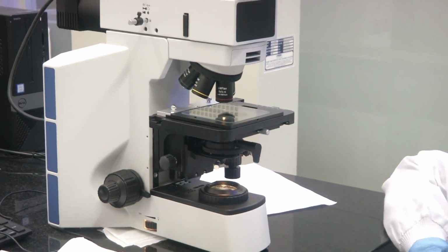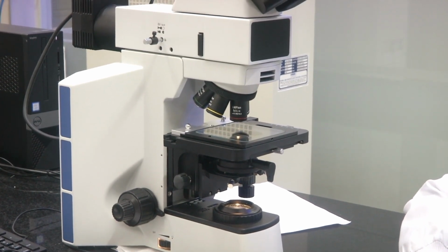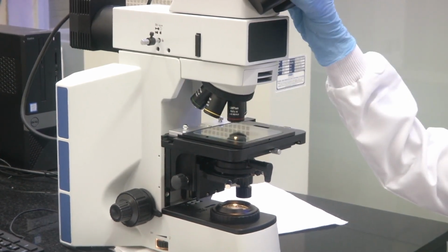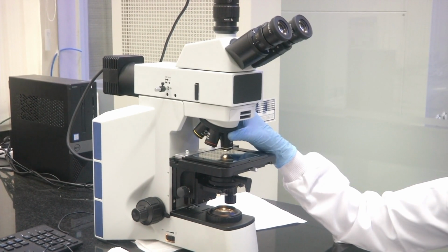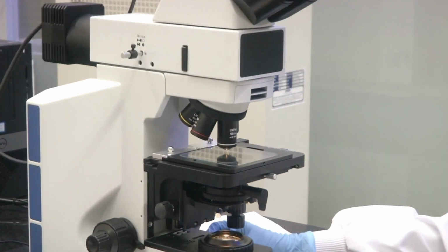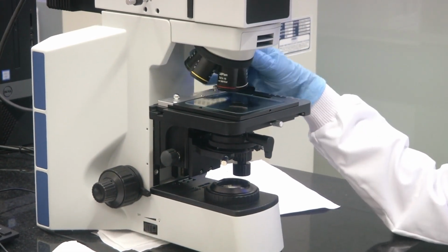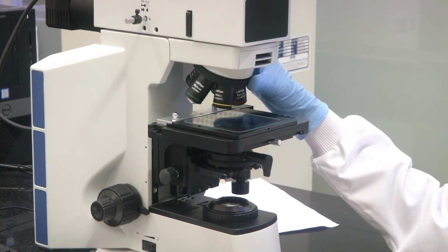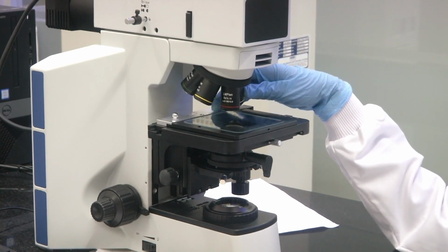Now, let me get back to a few basic concepts about microscopy. The two main optics arrangements for an optical microscope are the objective and the eyepiece. I hope you can see the objective arrangement here. This is a piece of equipment that moves in a circular fashion. Let me switch off the light source for some time. This part of the microscope, which I am rotating now, is called the turret. This turret can house multiple objectives.